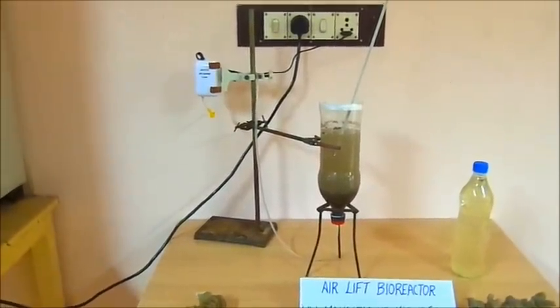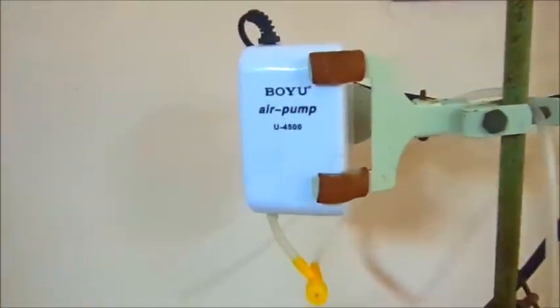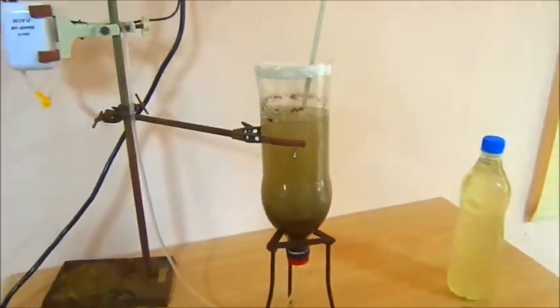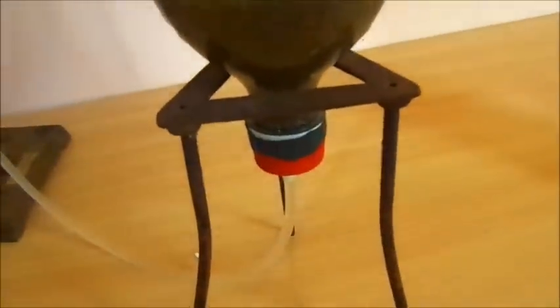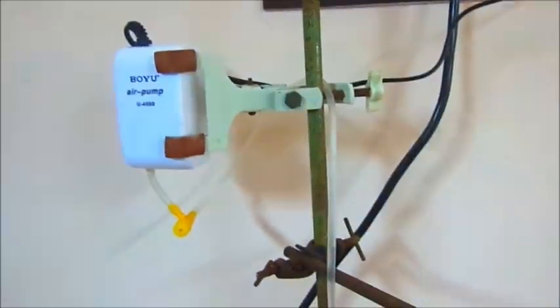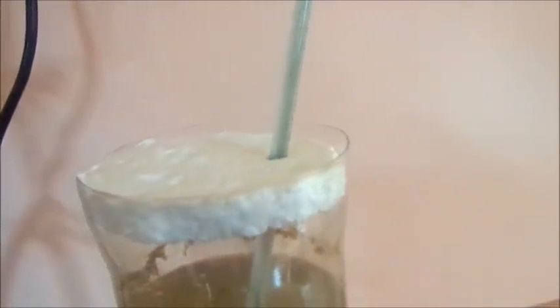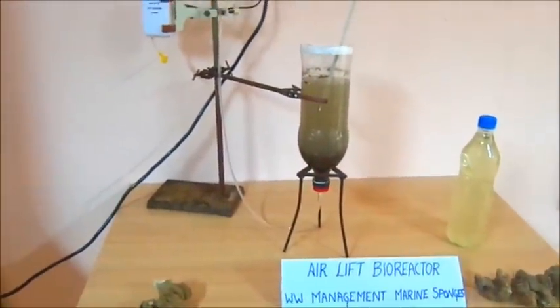Now let me describe the modeling of the fermenter. This model contains a baby motor which is usually used in fish tanks. Below there is a yellow indicator used for controlling the air flow. The body of the fermenter is made from a 1 litre cool ring bottle. The spager has been placed at the bottom of this bottle and connected with a tube to the pump for air flow. The top of the fermenter is closed with thermacool insulation and contains holes to fit a thermometer, pH probe, and COD and BOD probe if needed. The total cost of the fermenter is above 180 rupees.